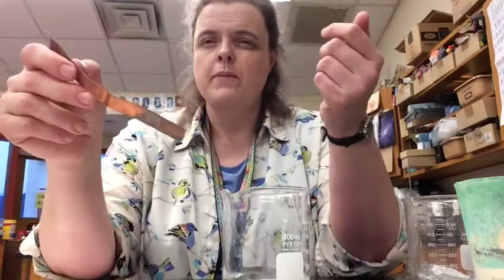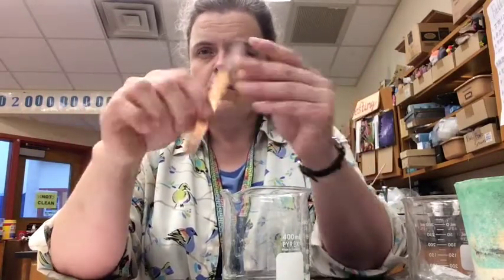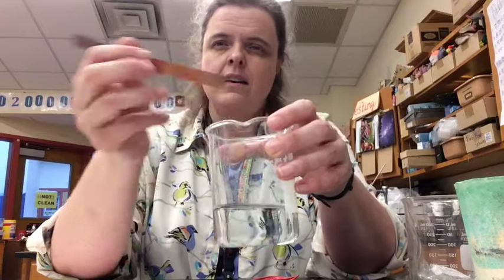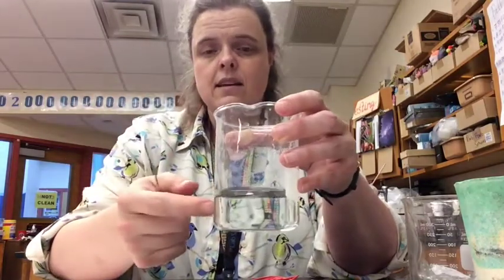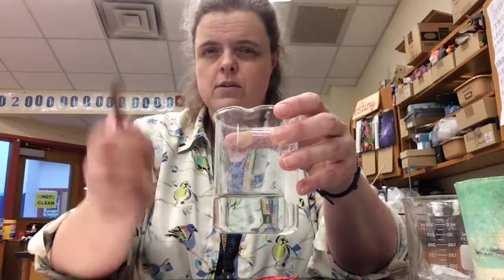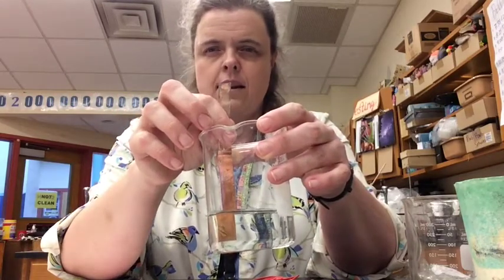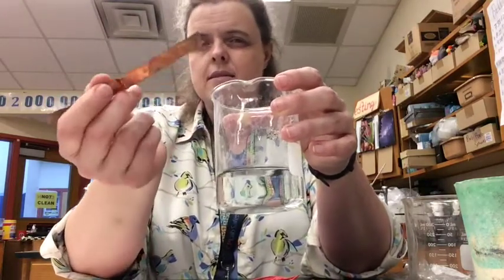What about if instead of zinc, we use a piece of copper? So this has to do with how active it is. This is copper with an oxidation number of 0. Will it change and become copper ions when I put it in zinc ions? Does copper that's 0 want to oxidize in zinc that's ions? Does it want to reduce? Does that happen when you put copper in zinc? Do you see anything happening? No, that doesn't really happen.